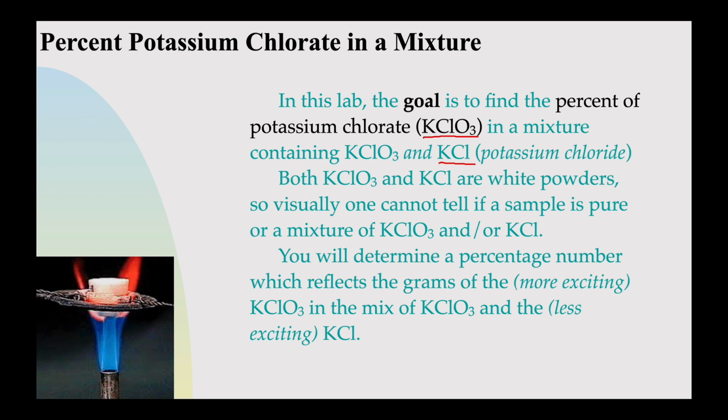So this is a technique that scientists use sometimes to see how pure your potassium chlorate sample is. And again, potassium chlorate is what we're after because it's more exciting, more reactive than potassium chloride.